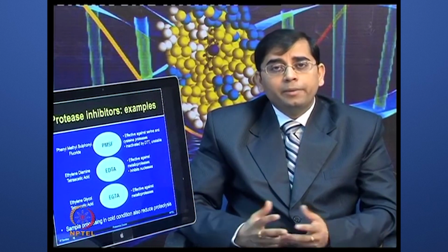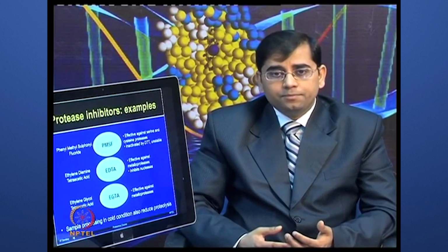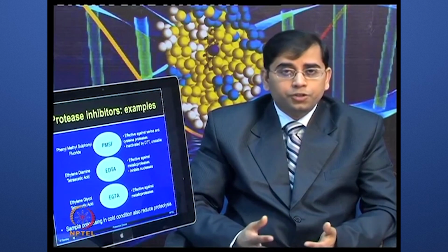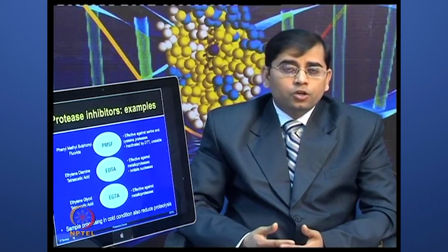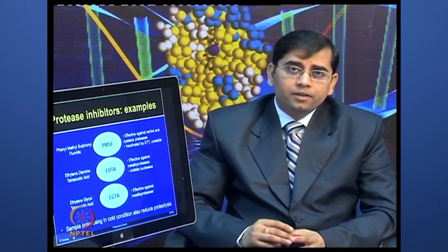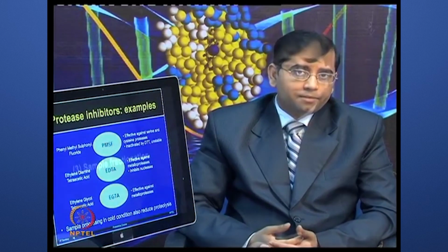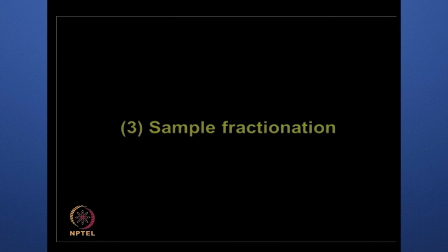Now, when you are making your sample preparation for proteomic applications, it is very important that you process the samples in cold conditions to reduce any proteolysis. These proteolysis artifacts can be minimized by using cold conditions during the grinding as well as during the centrifugation steps. Now, let us talk about sample fractionation.